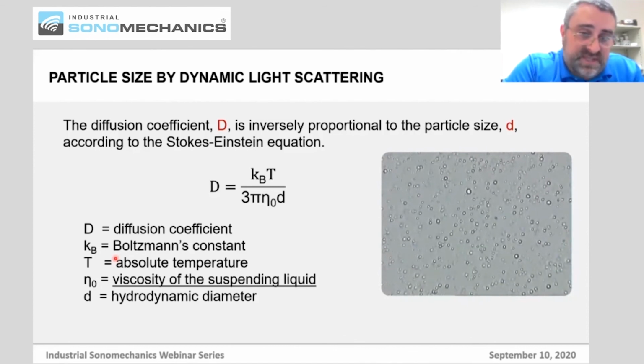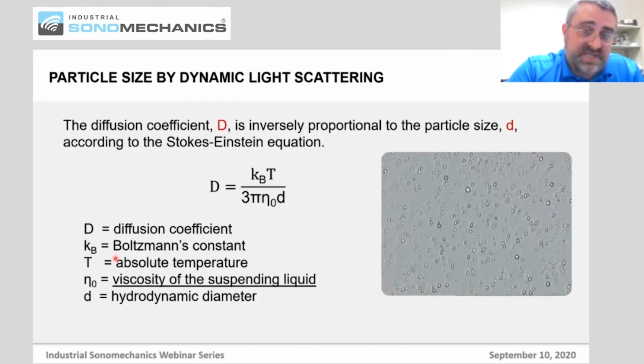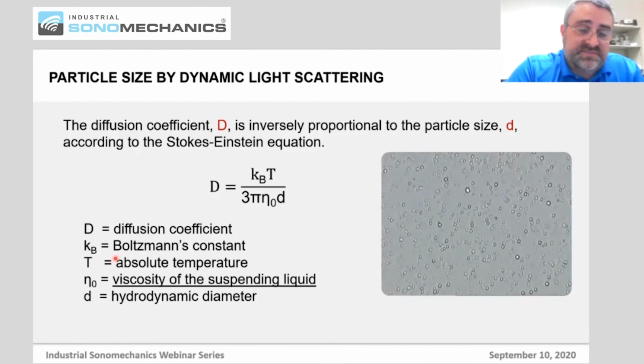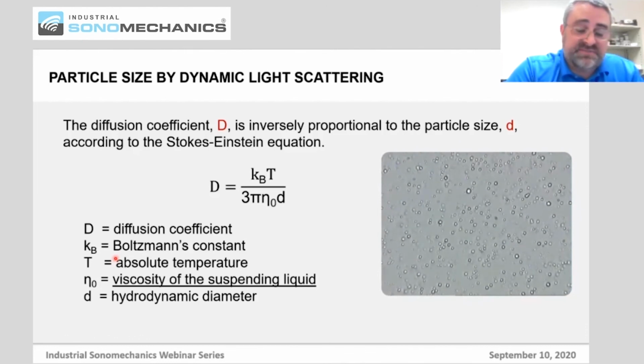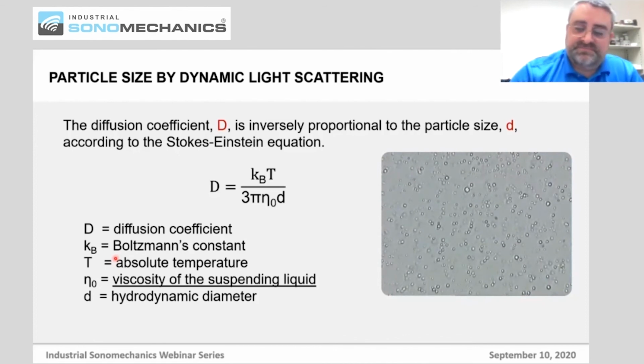Also notice that I'm calling this the hydrodynamic diameter, not the actual diameter. The reason is that this is the diameter of the particle based on its movement in water, which is the Brownian motion.